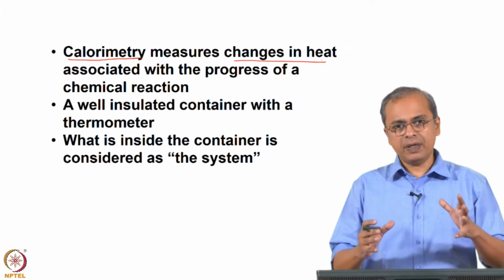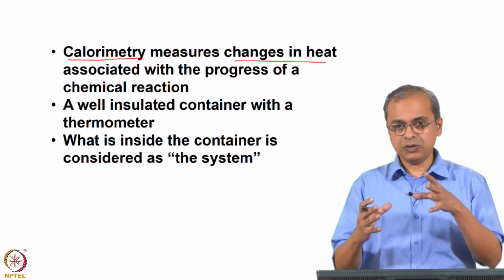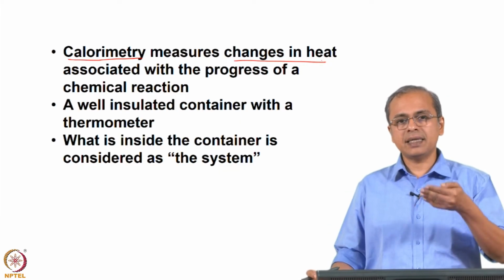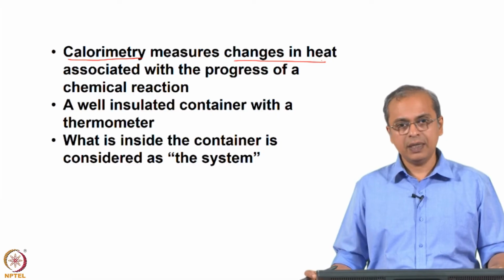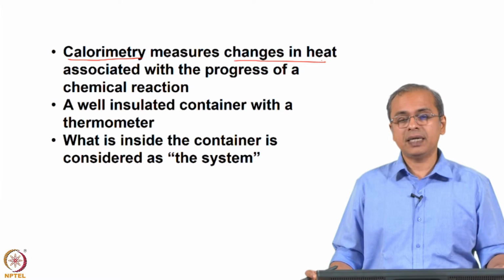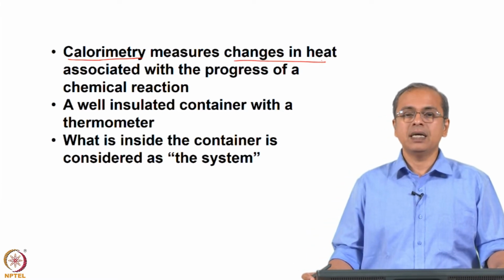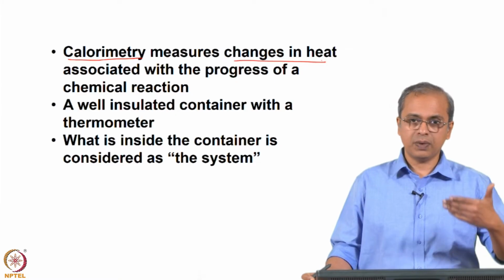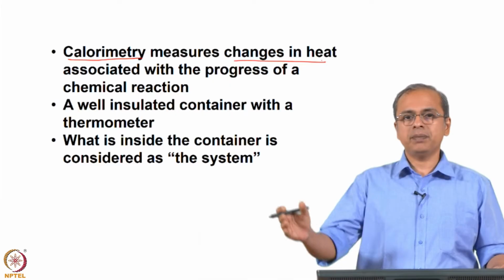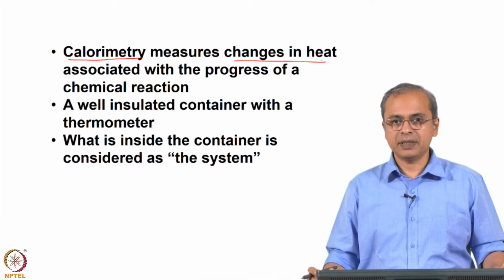It is important because once you get a sense of what that heat change is, you can extract different thermodynamic parameters out of it, and that is what you see as thermodynamic data. So, when you look up a specific heat and many other pieces of information in manuals or tables of different sort, they are all typically coming out of data from a calorimeter, where you are essentially measuring changes in heat.